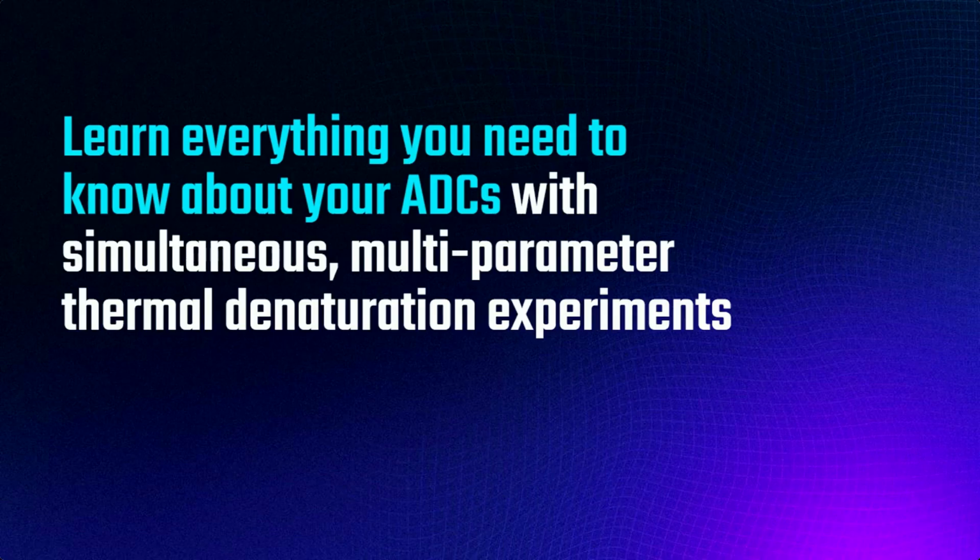So now that we've discussed the Panta, let's get into ADC characterization. As I mentioned in the beginning, there are added destabilizing risks when it comes to engineering ADCs, which is why it's important to have detailed information on their conformational and colloidal stability both before and after the conjugation reaction.